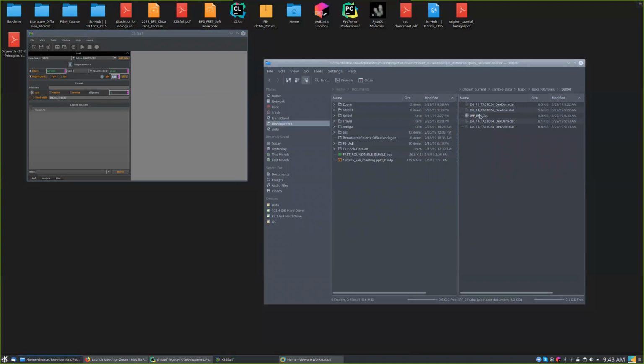Now you can simply click on the file and drop it here to the loaded file window. Now do exactly the same for the donor sample, donor excitation, donor emission. This sample here, the donor-only sample, donor excitation, acceptor emission, we don't need to load here. We only have to analyze how many counts we have in the channels. I will talk about this later.